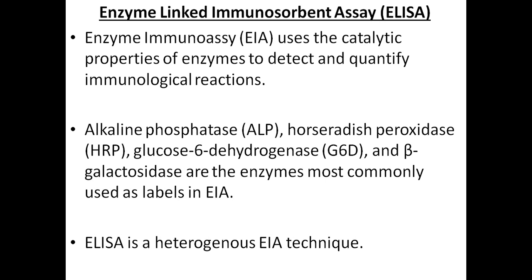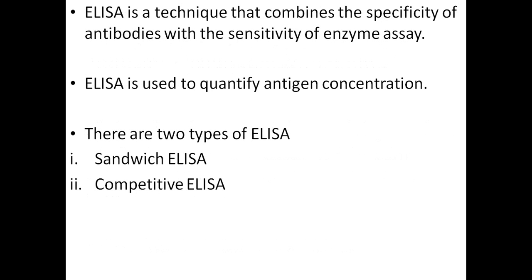So ELISA is a heterogeneous enzyme immunoassay technique. ELISA is a technique that combines the specificity of antibodies with the sensitivity of enzyme assay.